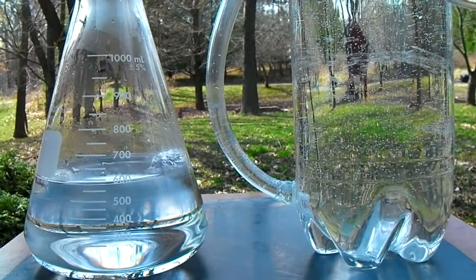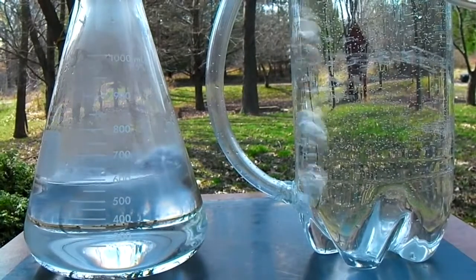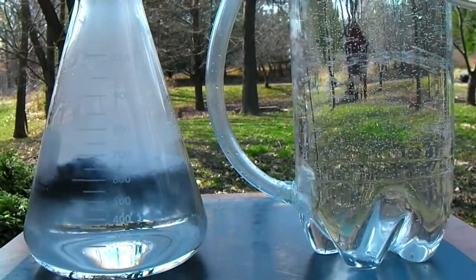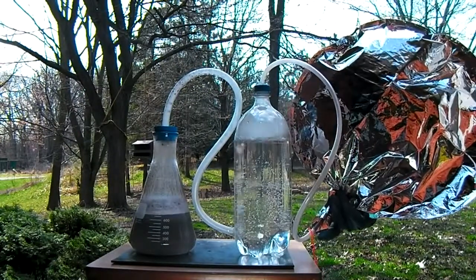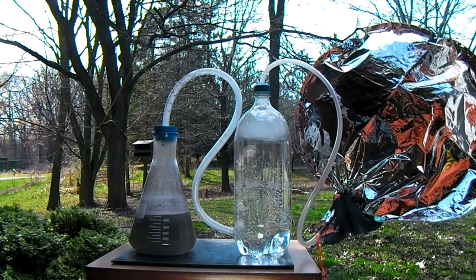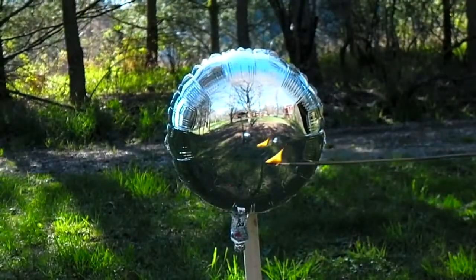In this video I'll be demonstrating how to extract clean burning hydrogen gas from a common acid available at most hardware stores. A balloon filled with hydrogen can lift approximately 10% more weight than the same size balloon filled with helium. The only reason why hydrogen is not used in place of helium when filling balloons is because it is so flammable in the presence of oxygen.